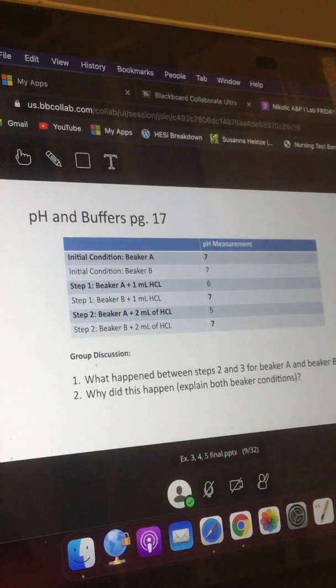And that finishes the idea of which one has a buffer. Now, it's a good idea to read the buffer information here because the buffer information is going for our next experiment. So again, good idea to read this because it gives you an experiment and what we would see. And this helps you understand the buffer system called the carbonic acid bicarbonate buffer system. All right, awesome.